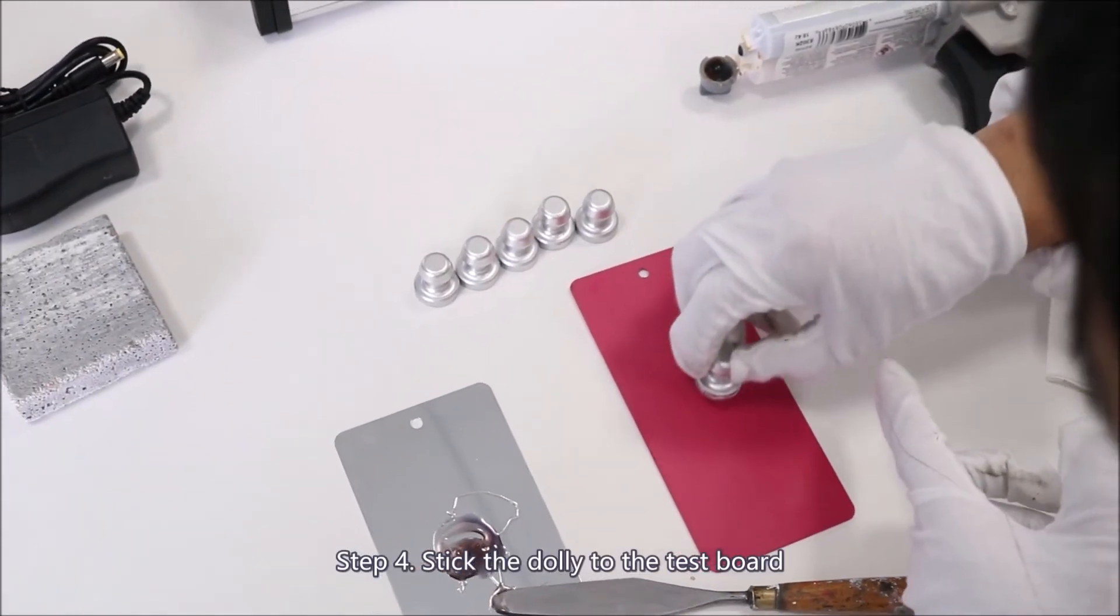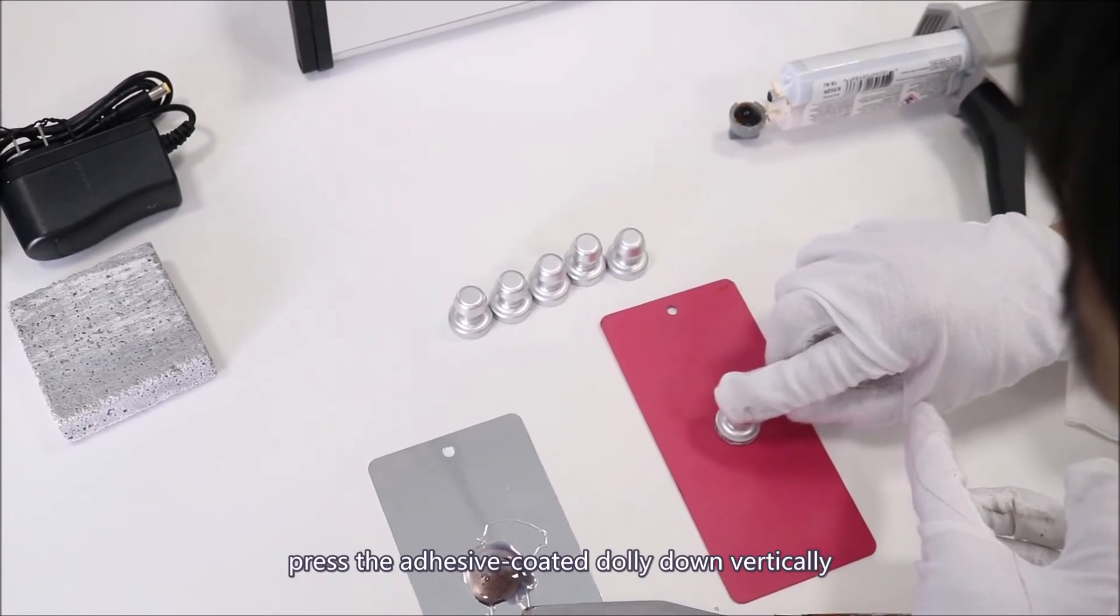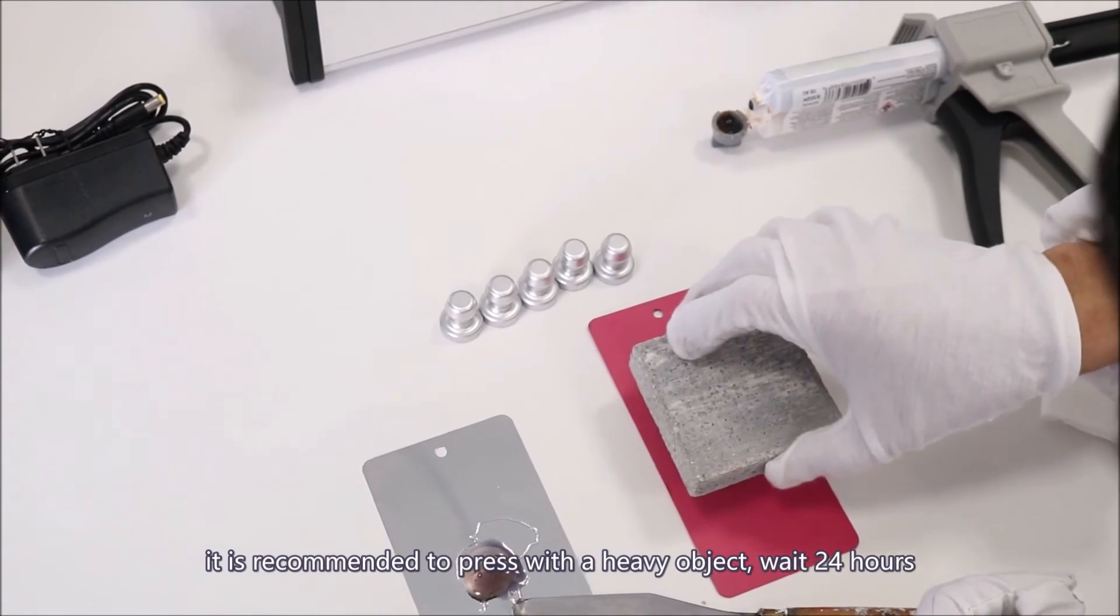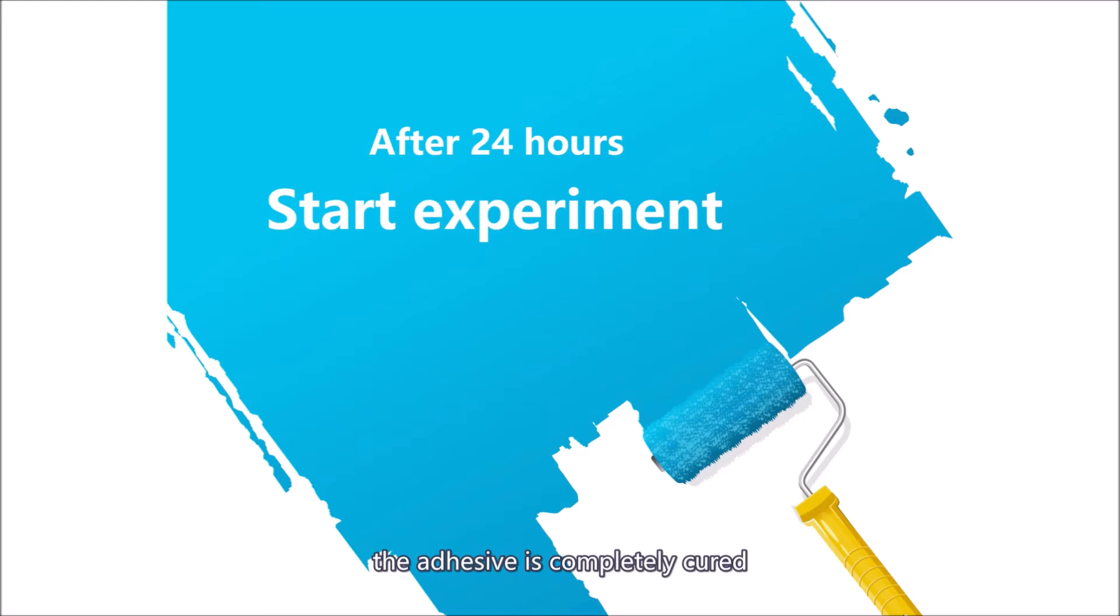Step 4: Stick the dolly to the test board. Press the adhesive coated dolly down vertically. Try to hold it in place. Do not move or rotate. It is recommended to press with a heavy object. Wait 24 hours. The adhesive is completely cured.